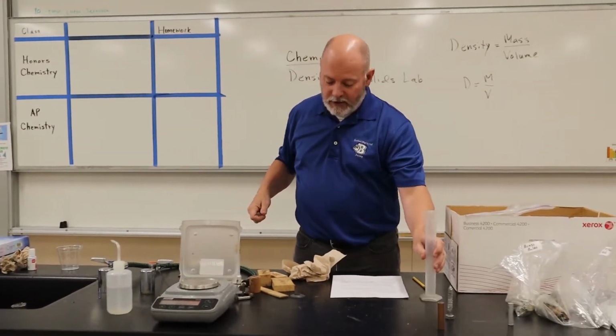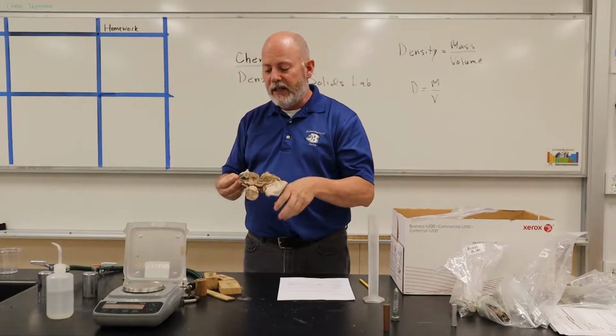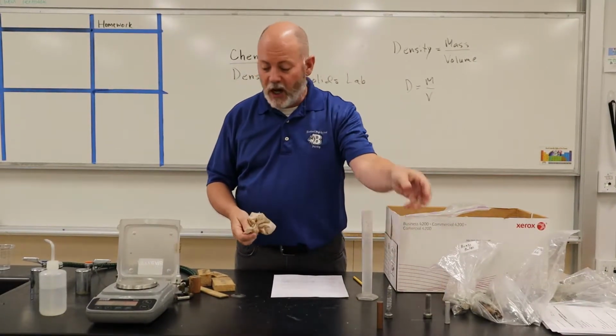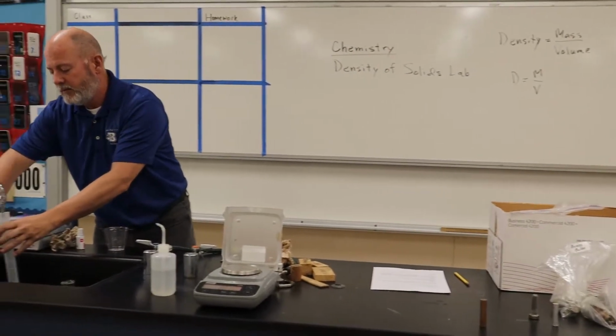And that's another thing. When you do lab work, you want to start looking at things that might cause your results not to be so good. So that was an obvious one, spilling the water. All right, so let's go to the iron bolt.